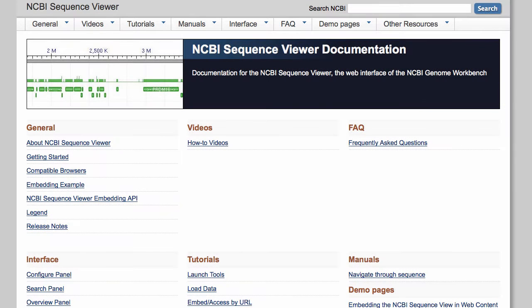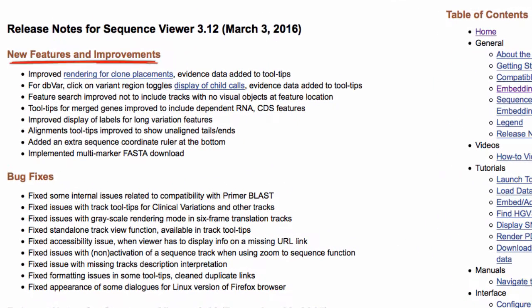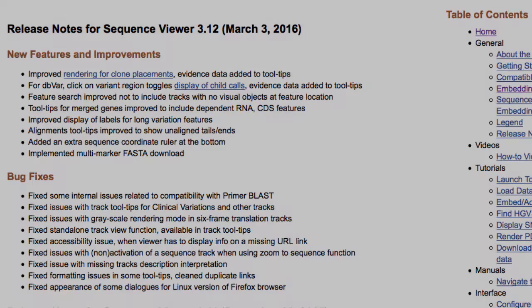One of the many recent improvements to NCBI's Sequence Viewer is to allow expansion of child variant calls in the dbVar track. dbVar is our database of structural, or copy number variants. I'll demonstrate this function in just over a minute.